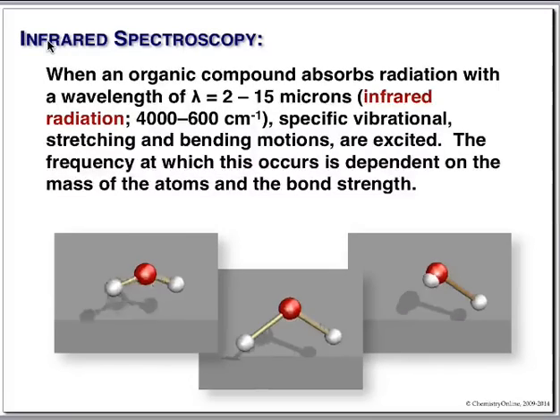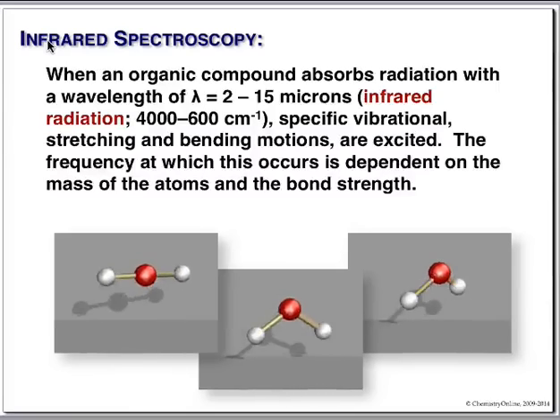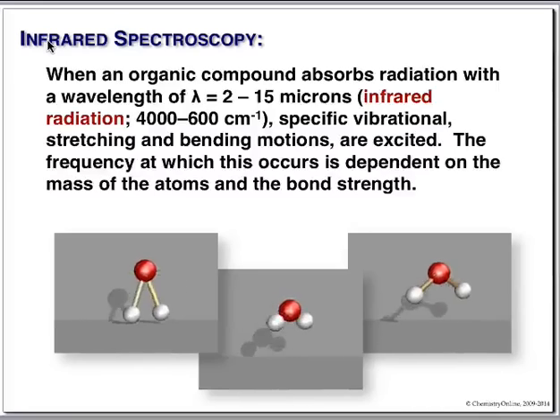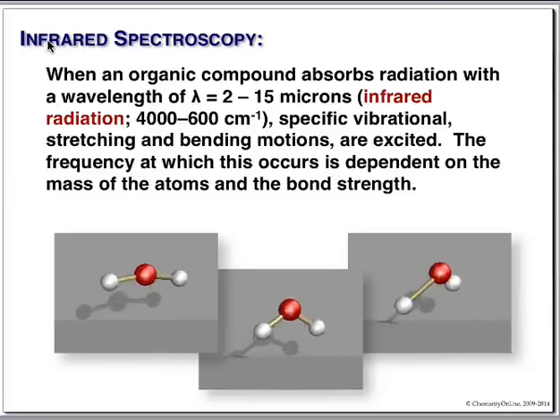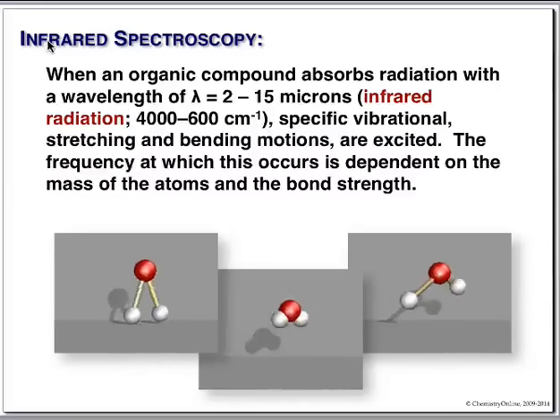Wave numbers are often used in organic chemistry because they're actually easier to remember than fractional wavelengths. 2.76, 3,000, much easier. So we'll talk about wave numbers. Remember, both scales are entirely equivalent.